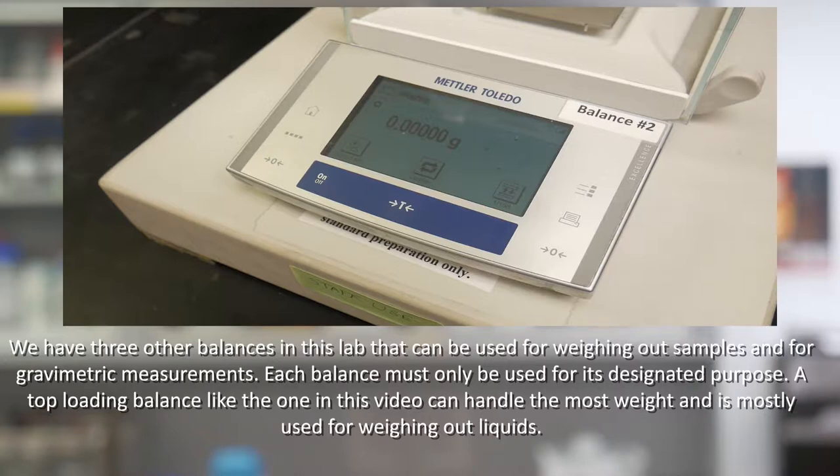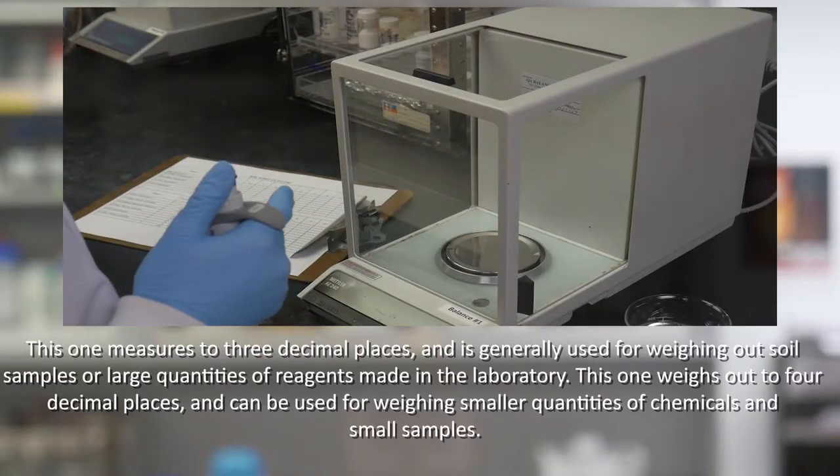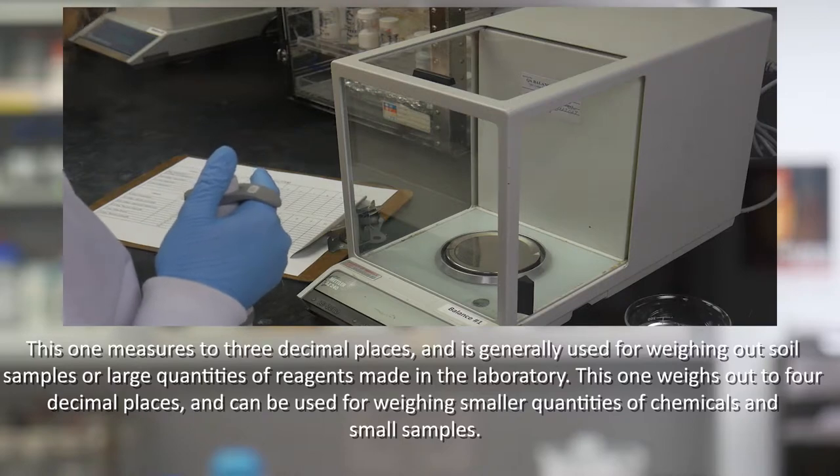We have three other balances in this lab that can be used for weighing out samples and for gravimetric measurements. Each balance must be used only for its designated purpose. A top loading balance like the one in this video can handle the most weight and is mostly used for weighing out liquids. This one measures up to 3 decimal places and is generally used for weighing out soil samples or large quantities of reagents made in the laboratory. This one weighs out to 4 decimal places and can be used for weighing smaller quantities of chemicals and small samples.